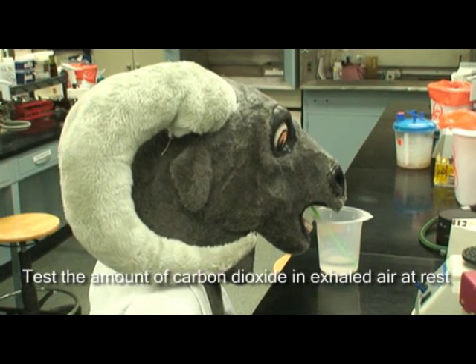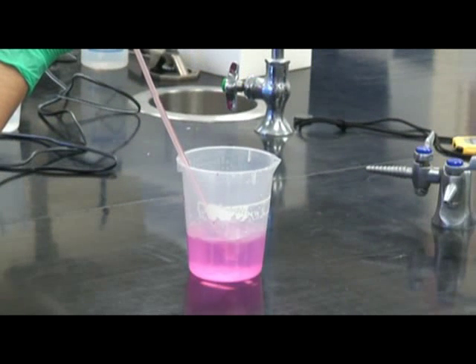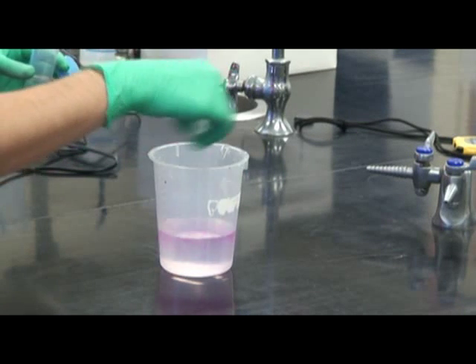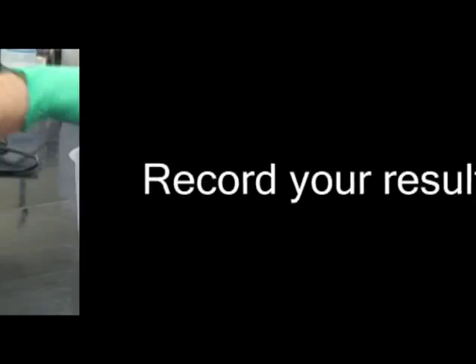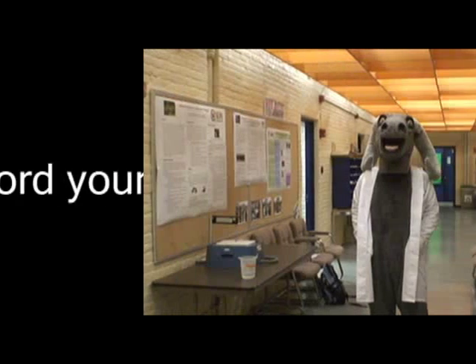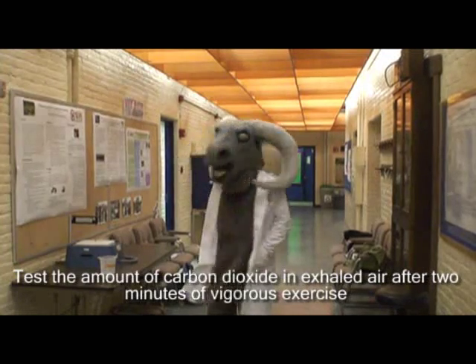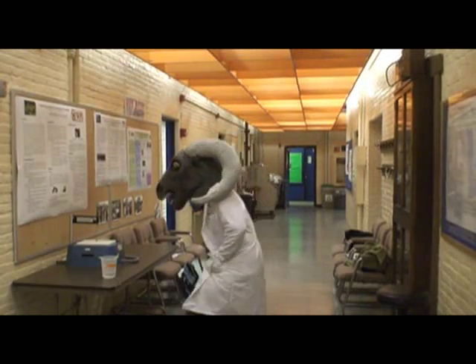Test the amount of carbon dioxide in the exhaled air at rest. Record your result. Then test the amount of carbon dioxide in exhaled air after two minutes of vigorous exercise. Record your result.